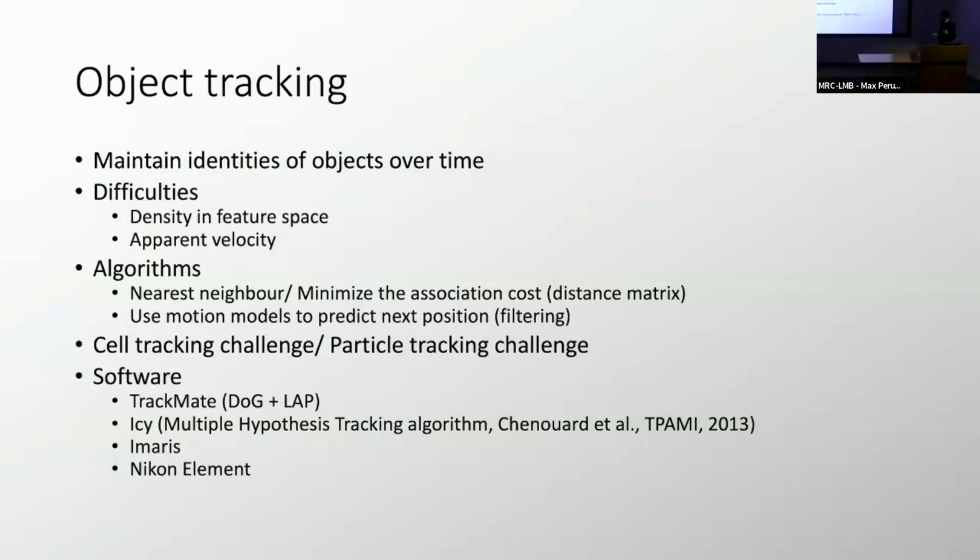That's cool. LapTrack. It can also be combined with Cellpose and StarDist, or basically masks, or ROIs. There are versions which can process the output of some cell segmentation.